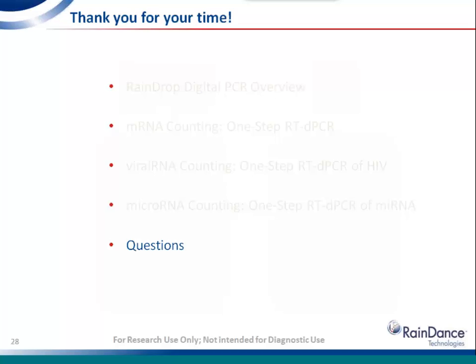Is it true the ThunderBolts panels run on the RainDrop system? Yes, and that's an interesting question. It was not the focus of this talk, and maybe there'll be a future webinar on that. The ThunderBolts cancer panel is a very unique product using just the source instrument, and it prepares samples that are as low as 10 nanograms of FFPE material for targeted multiplex sequencing on an Illumina platform.